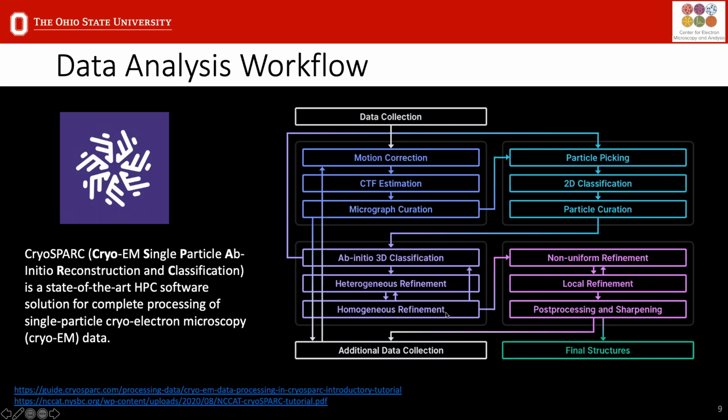Okay, so that was a lot of information. I think I'll open it up to any specific questions of things that I may have just quickly gone over. I don't want to go over time, so I want to leave time to answer any questions that people might have about CryoSPARC or data analysis.